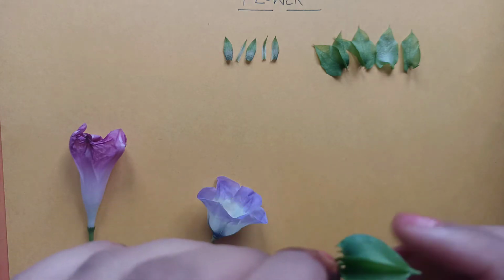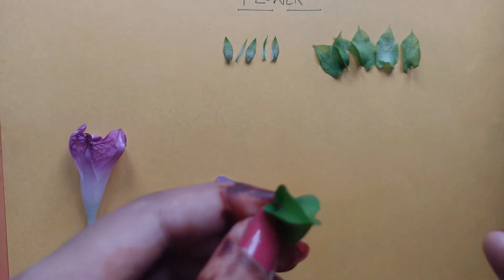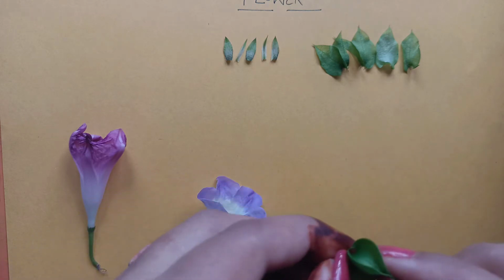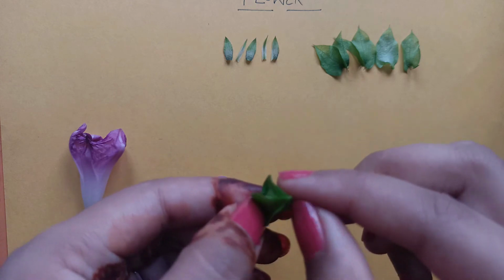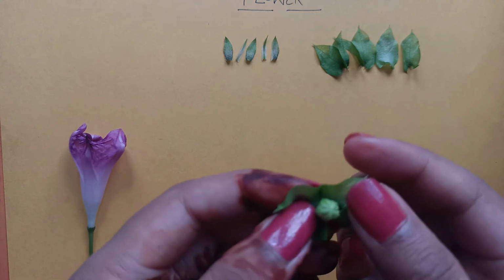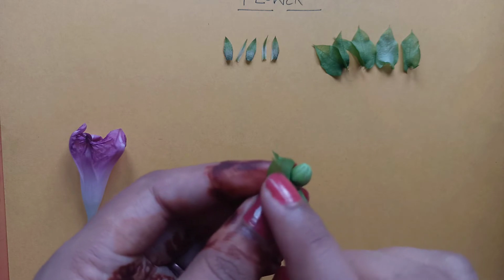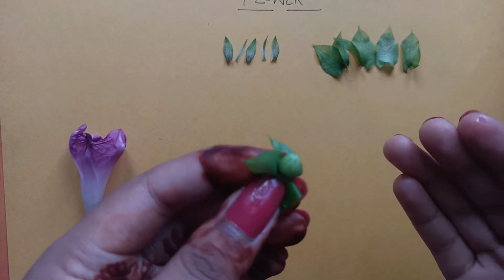Okay, like if I tear this, this is a bud. The sepals usually protect the flower in the budding stage. So you can see it is a closed bud over here. If I just tear it out, you can see the inner parts of the plant are growing. They are forming over here. So what these sepals do is protect this bud in the early stage.